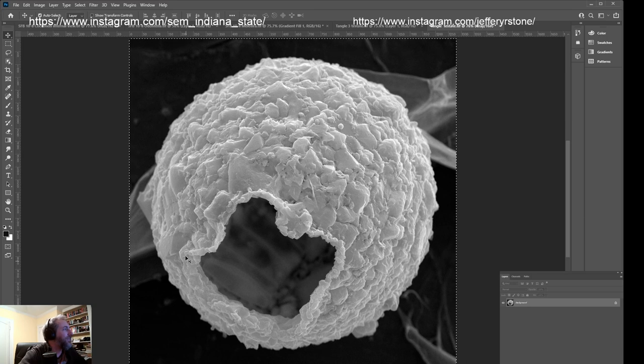They create their skeletons in a process that we call agglutination, which just means gluing things to their skeleton. And this one has agglutinated diatoms onto its skeleton, and like tintinnids and other things, they basically make their house out of whatever's available, sort of like caddisflies, if you know what a caddisfly is. Whatever's in their environment, they make as part of their home, their nest, or their test in this case. So it's kind of cool. Interior designer. Sometimes they have the diatoms on the outside as well.